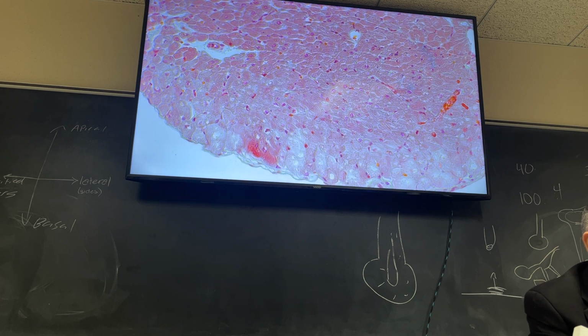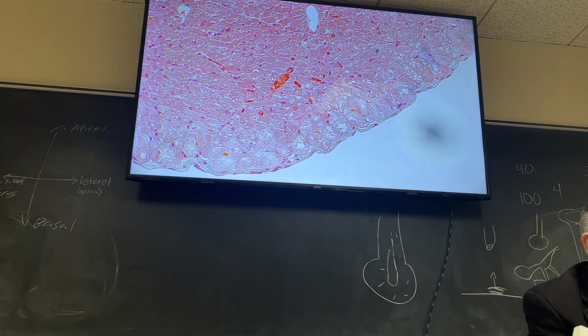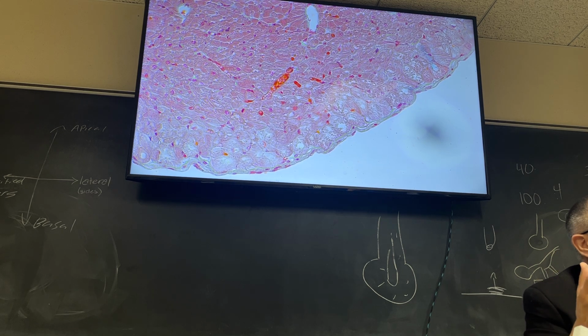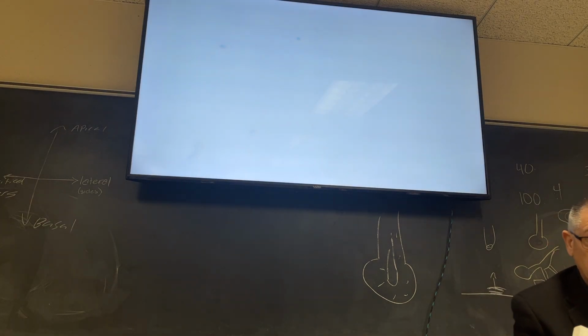It's not a huge change. But you can see lots of them there, and they're fairly easy to spot. All right, any questions on Purkinje fibers? I know you can probably guess the name of the slide. Purkinje fibers, all right. And it actually says human heart on it.